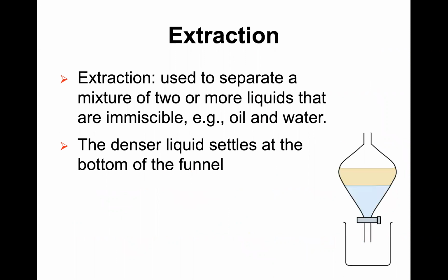So here is the extraction. As I show you, this is the separation funnel. Normally at the top, we will cap that. But when you try to open this one, you have to leave the cap open. Otherwise, the pressure will hold them, and they will not break through, right? You see the two layers normally show different color, or because of a different refractive index, you can see the boundary. So that's how you can separate them, right?